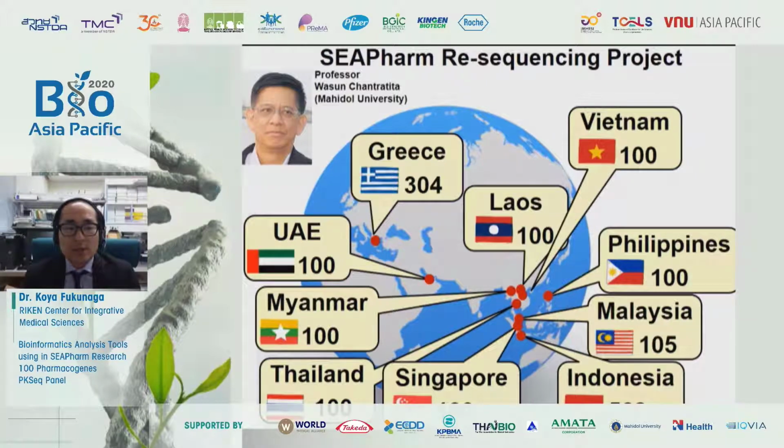This slide shows the number of samples in the SEAPharm resequencing project using PKSeq.